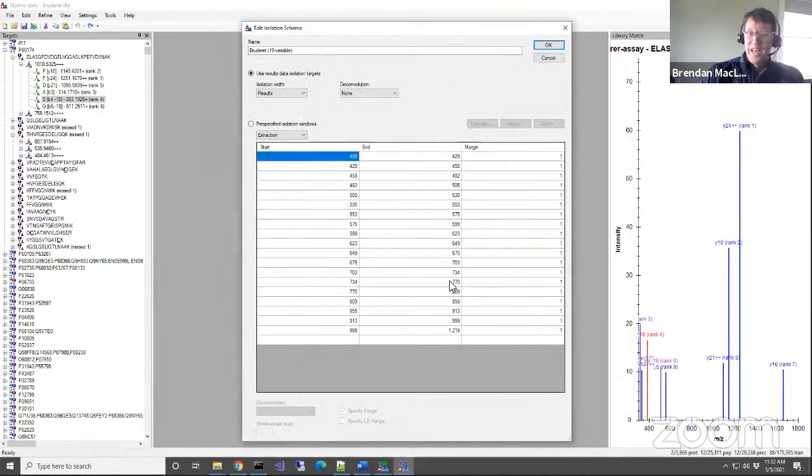And if you had a gap in here, Skyline would go, oh, great, I can't measure anything. Suppose you had a gap of 100 or 200, then Skyline would not include any precursors. So having foreknowledge of what the isolation scheme is allows Skyline to come up with the targets. You may be coming up with the targets in the isolation scheme before you have any raw data. So yes, this is pretty flexible.